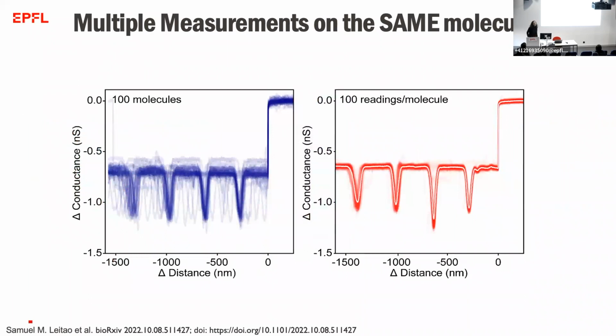So we could then, I'm thinking about Samuel, go from one molecule to another, looking at 100 different single molecules and controllably scanning them. But he can also choose to pick a single molecule and rescan this molecule hundreds of times. Similarly as in localization microscopy, here we can improve our signal even further by summing the signals.